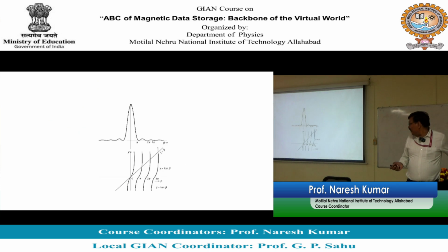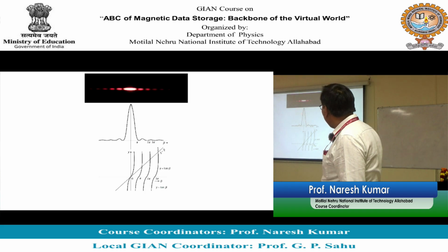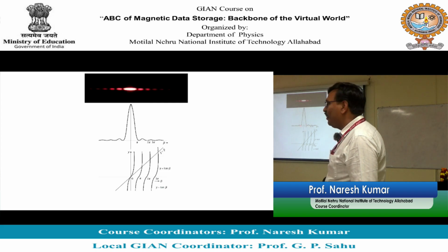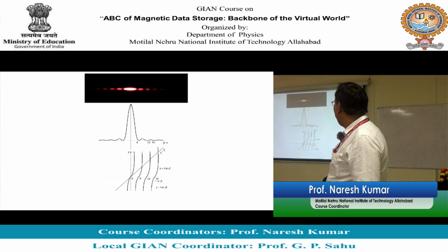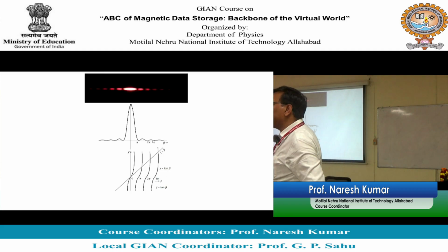So that's a typical spectrum theoretically you should be observing. Theoretically there should have been a maxima, afterwards a minima, and then another maxima, then minima, maxima, minima. And if you see the experimentally observed data, it matches, right? When beta is equal to 0, you have huge intensity. When you go a little away from here, at this position you see dark. This is the position when beta is equal to pi. At pi it is 0. And when you are between pi and 2 pi at this position, yes, there is an intensity, and this intensity is about 5% of the central intensity. So my experimental data can be theoretically explained.